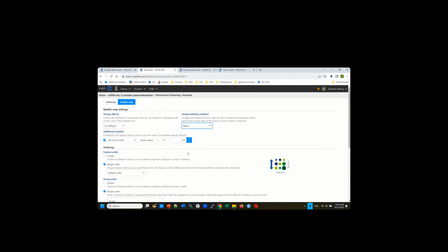You have to look at the distribution of your normalized data. Like if you use Seurat SCTransform, you might have negative values. So again, you determine what you think counts as expression. Greater than a certain value, I will call that expression. And then I want to calculate the percentage of the cells that have expression of this gene.